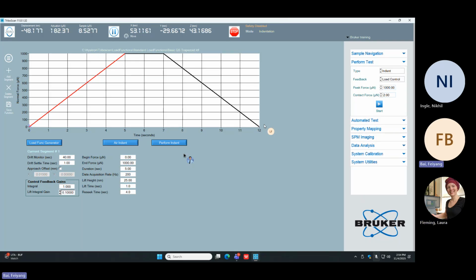Nope. Okay, let's go ahead and let's change the peak force to 5,000. I'm going to let you run here for training purposes. Oh no, I lost you. There you go. Okay, now go ahead and let's see.